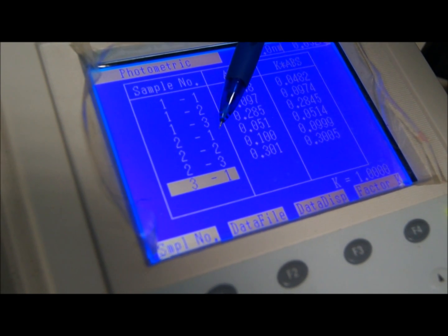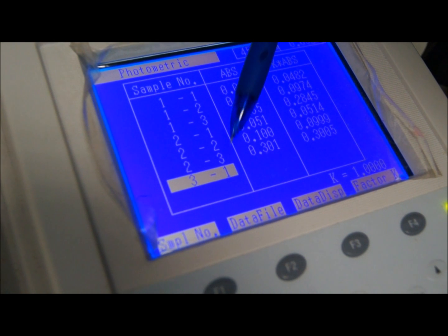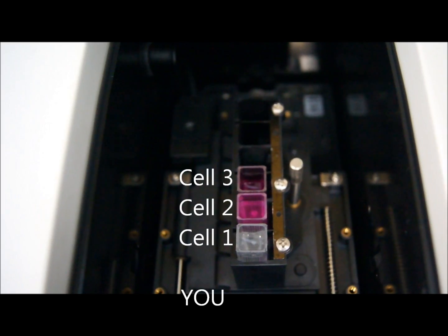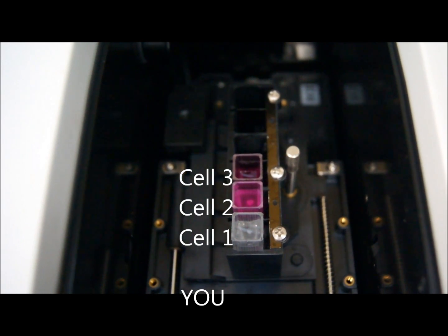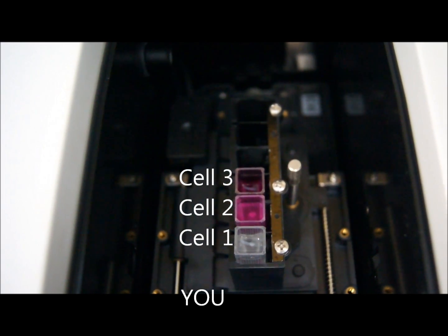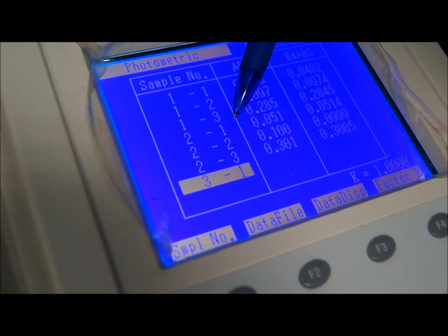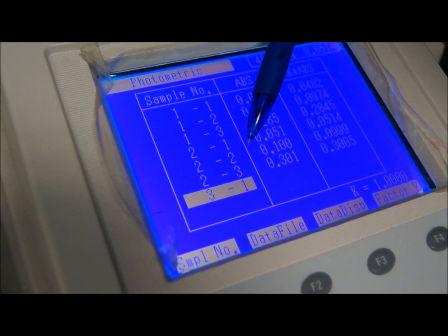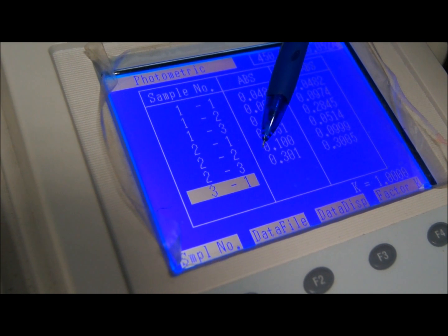And these are cuvettes 1, 2, 3 that we placed in order just now, with 1 being closest to us and 2 being further away and 3 being the furthest away from where we were.